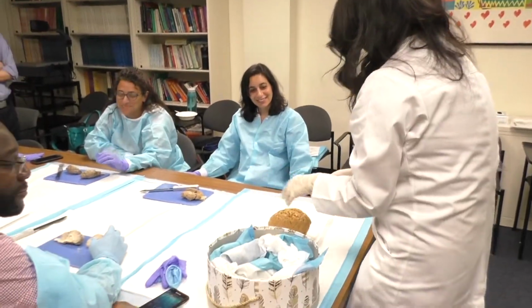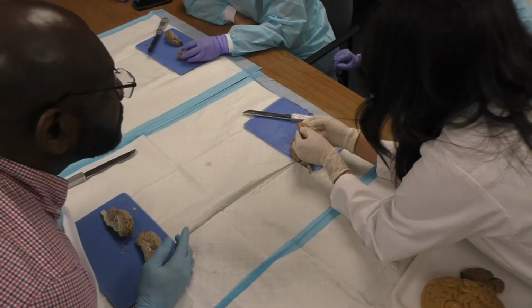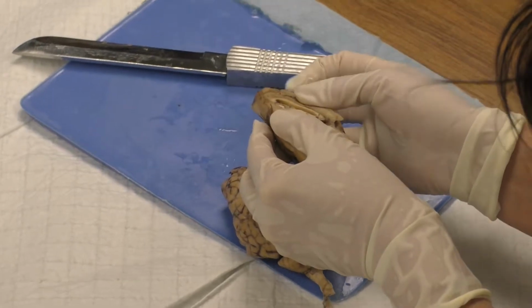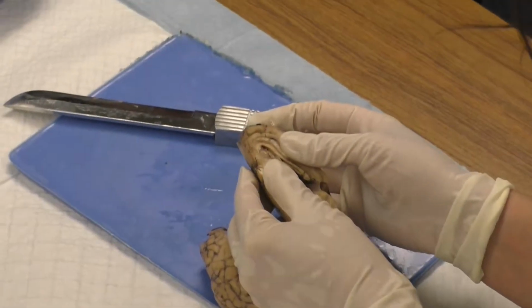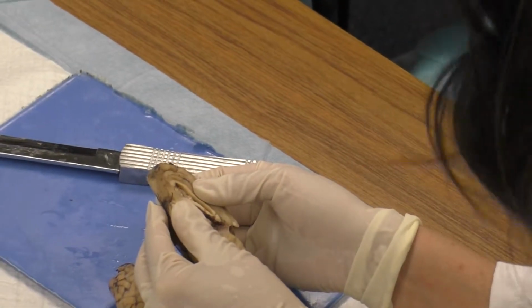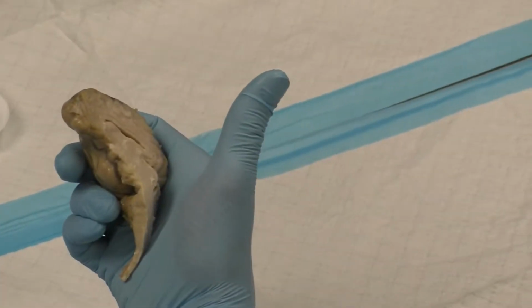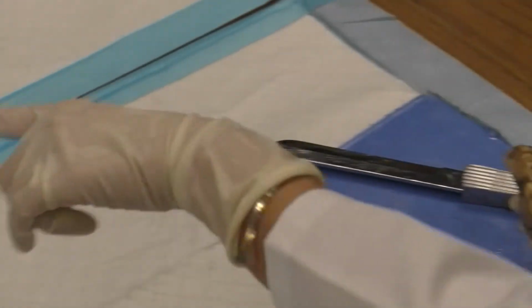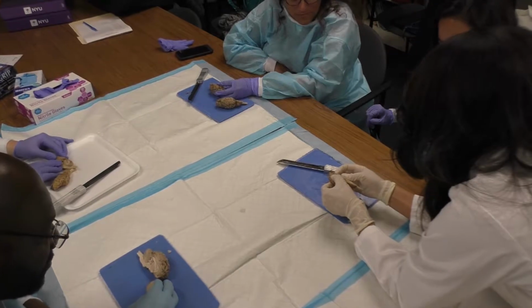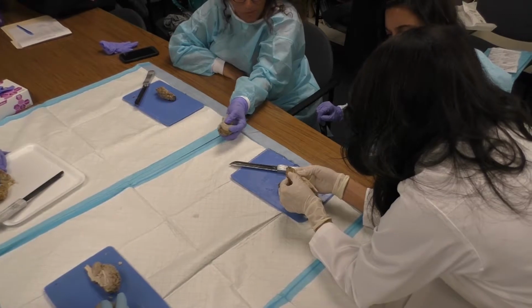This lump right at the front. So this is the front of the brain, right? Can you identify that lump in your preparation? There's a big lump there. Is that this one? Yes. You got a big lump. Right here. Yeah, big lump too. Sometimes you have to dissect it out to find the lump. Like this one, you have this thin covering here that has to open up. Because it looks like I got all my lump on one side.